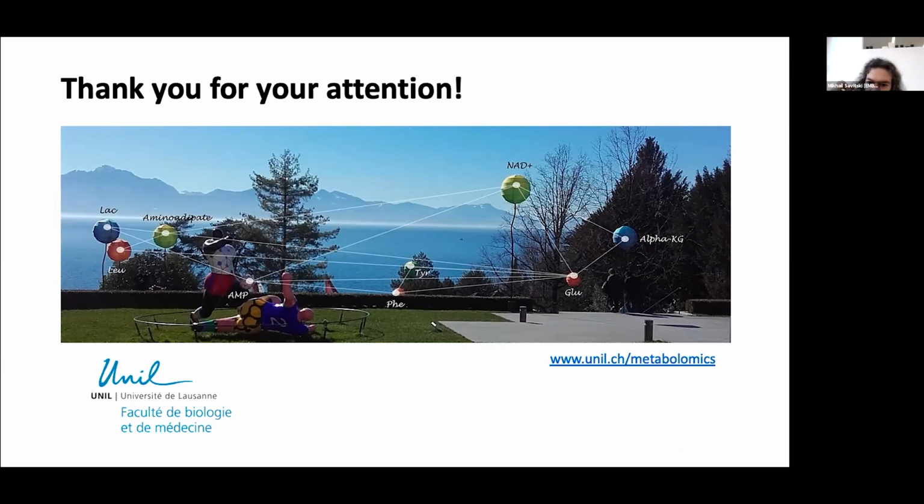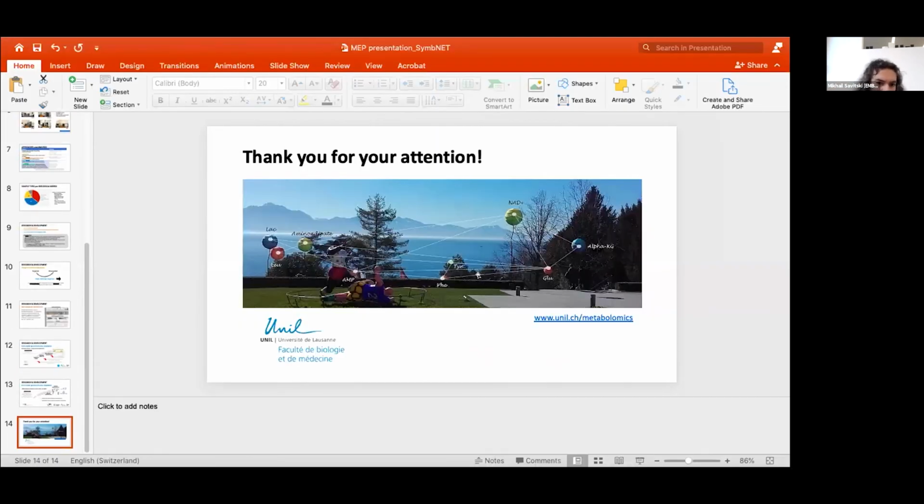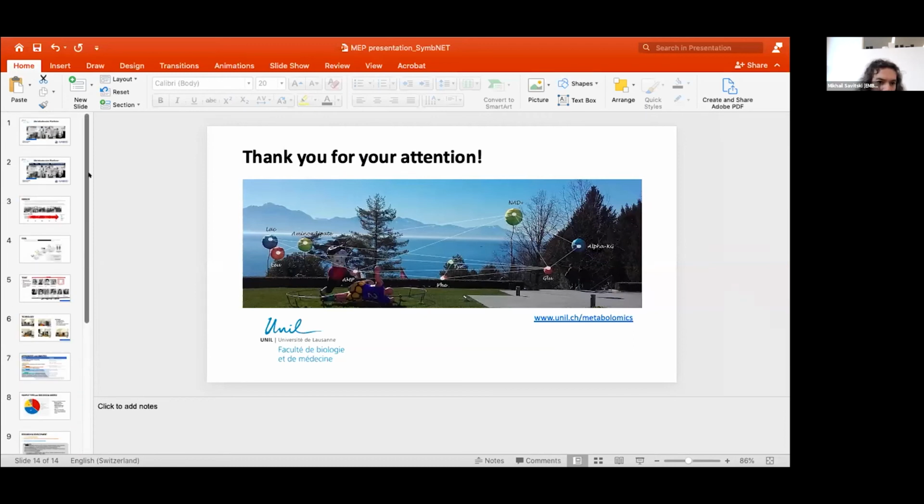Thank you very much, Julijana. Maybe just a quick technical question. Does the metabolite extraction work equally well for tissues as cultured cells, or are there any technical challenges between these two?